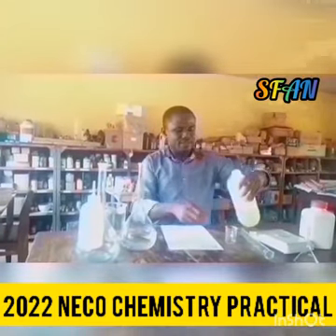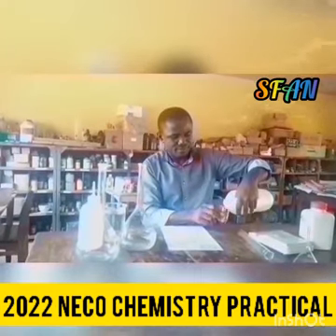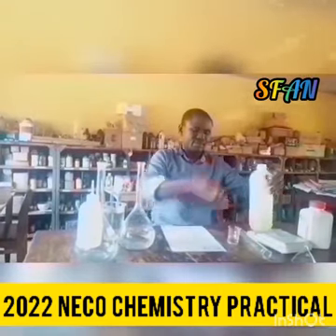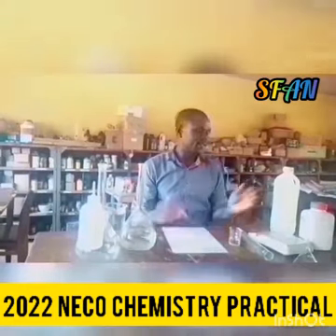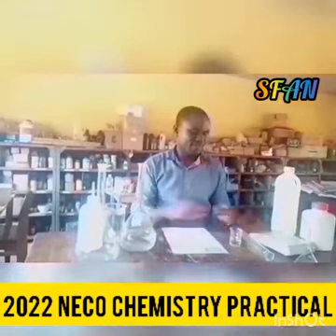So I'll transfer a little of my acid. Please, when preparing your reagents and you are using acid, make sure you use hand gloves.